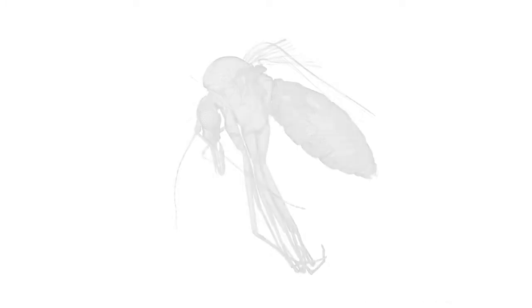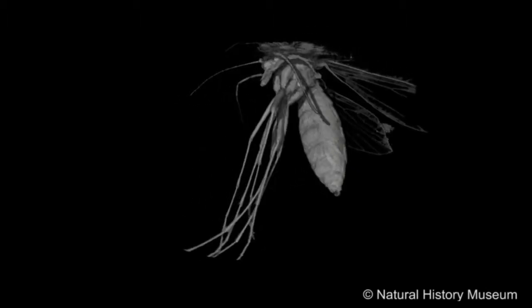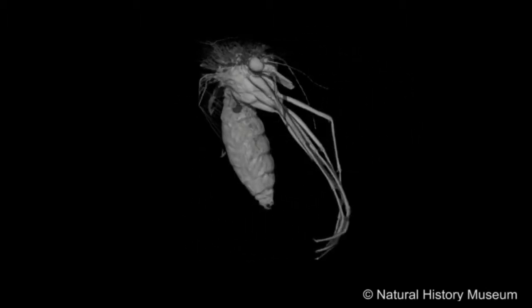So we thought this technique would be really worthwhile testing on the sandflies and blackflies that are familiar to members of the Gnatwork community. Firstly, with the sandflies, the hypothesis we're looking at is that the parasites will secrete a gel that causes changes in the sandfly gut. Basically, it causes an increase in the volume. And through the scans we'll be able to actually measure the volume of the sandflies and compare it between non-infected and infected sandflies at different stages of infection.